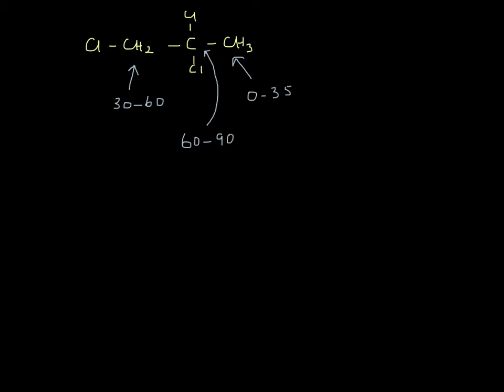And we can pull up those NMRs and look at them, but notice real quick where the protons would be. So in this case, these hydrogens here, they are attached to one chlorine, so we would say 3 to 4, and maybe a little bit higher because there's two chlorines next door. So this chlorine is directly attached and has the greatest effect, but those two chlorines over there will have a little bit of effect. So we'll say maybe slightly higher than 3 to 4 ppm.